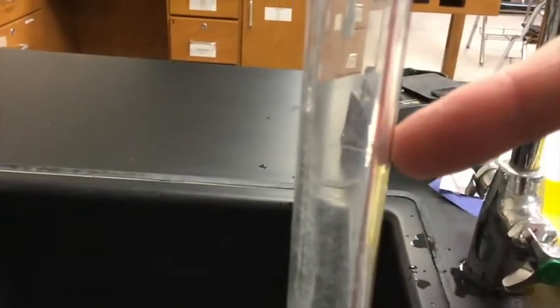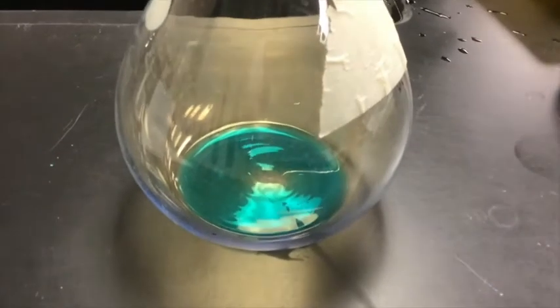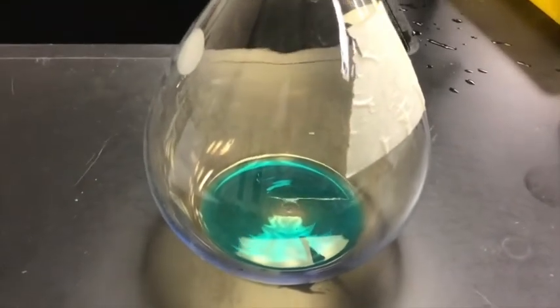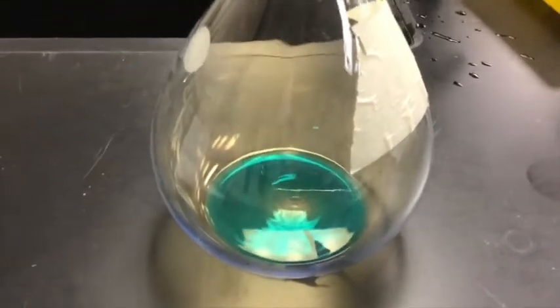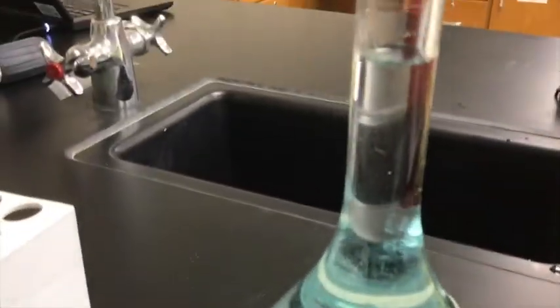And so now what we're going to do is take this and just add in water until we get up to our line, because remember, the whole point of a volumetric flask is that there is only one line that's there. And when I do that, I then know that I have 1 liter of this particular solution. And I'll do that now. So I have added in a bunch of water to our solution and diluted the heck out of it.